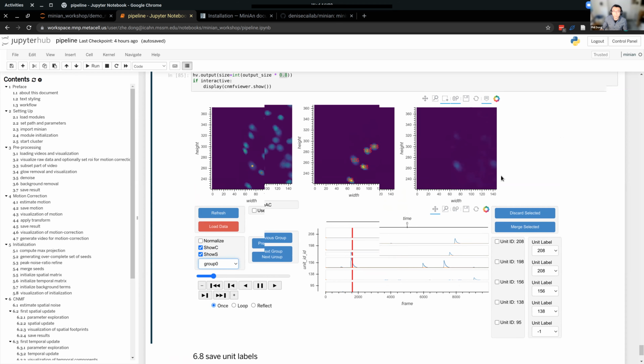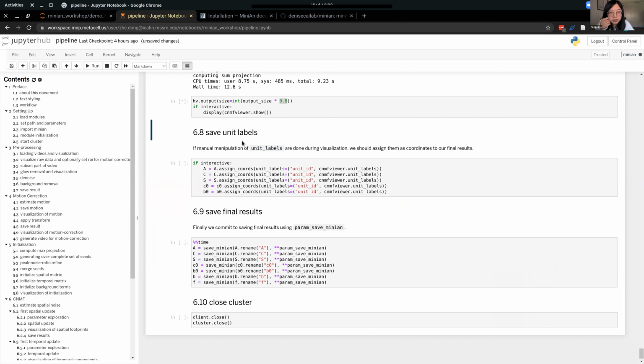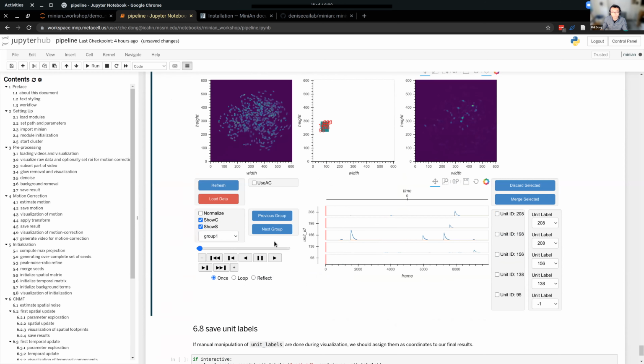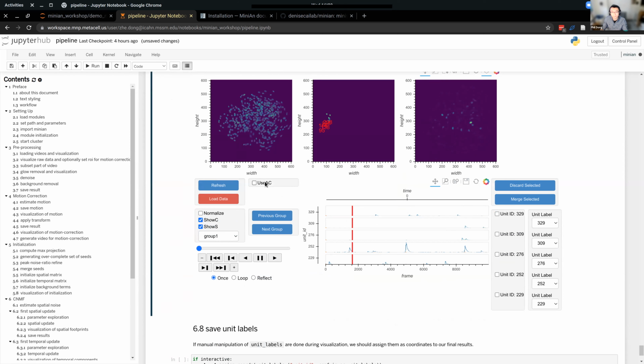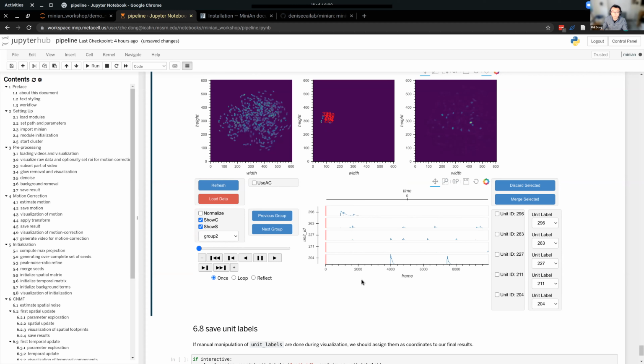But I'm just gonna rerun this. What if I want to see 20 cells and their traces? You need to hack the source. I'm sorry. But you can go through different sets of 5 cells. Okay, cool. So you do have a chance to go through all your cells. It's just that the simultaneous number of cells displayed is not really exposed. I guess I can expose it as a parameter in the future.